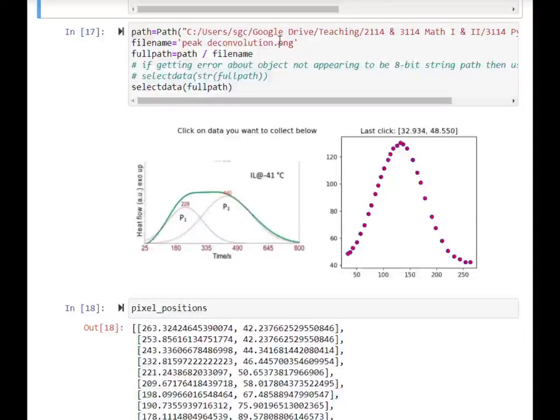Let's take a quick look at the week 7 lesson 4, I guess part 2. We just want to take a look at how we fit a 2 Gaussian peak model. So in this one, remember, I want to fit this green data set. This is the data that was actually taken, and I want to fit that to 2 overlapping Gaussians.